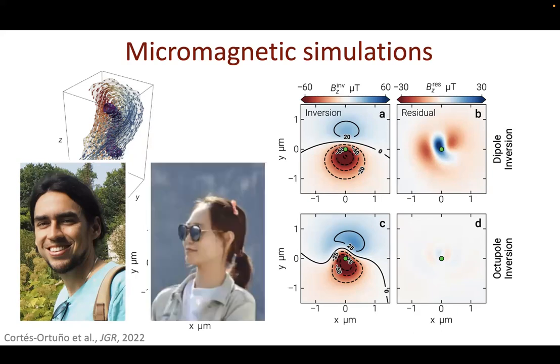And started this week. So her main project will be to prove this in practice. So we have like a perfect theoretical framework, but Gu's going to work on actually making these scans. Well, if you look really closely, there's one little issue, and that is that this has a surface area of about 4 square micron. And the resolution of our QDM is about 1 micron. So in a real QDM scan, this would go down to like 4 pixels. And then you cannot fit octupoles anymore, because then you lack a lot of data.